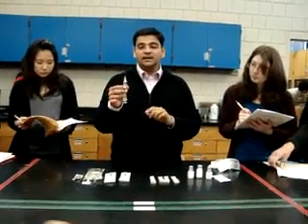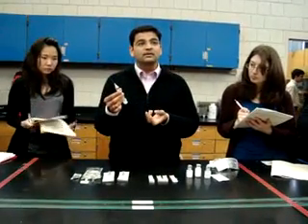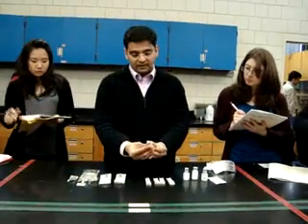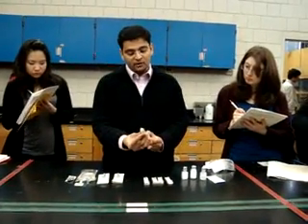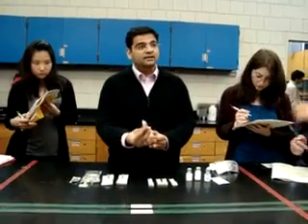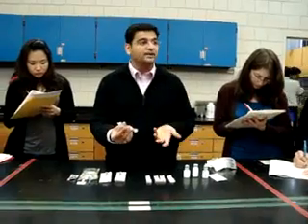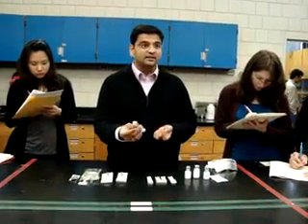The ports of contamination are the needle tip and the plunger, which you are not supposed to touch. Many students last time forgot to insert air. For example, if I am supposed to take 9 ml of the reconstituting solution, they forgot to insert the air first. You are supposed to insert the air first.